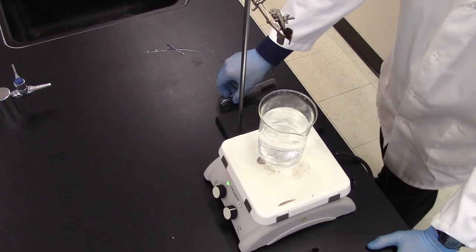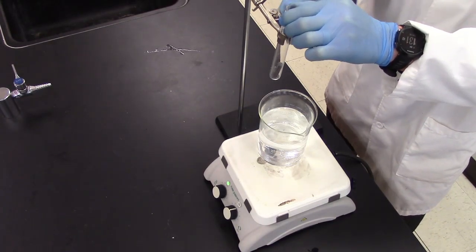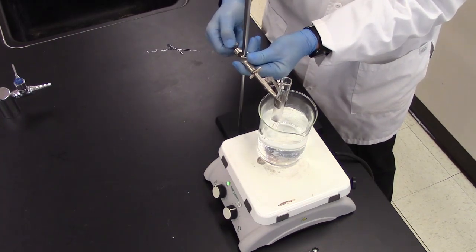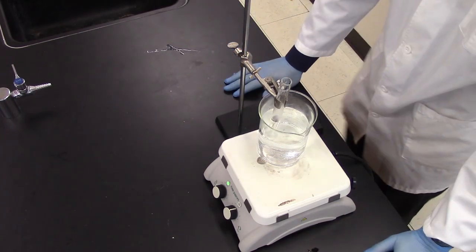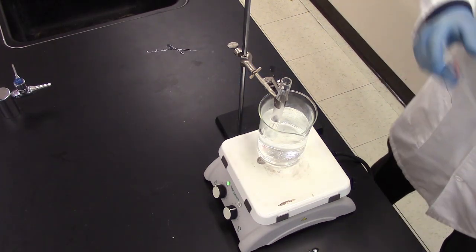My next step is to attach my test tube with the metal to the clamp here and then I'm going to lower my clamp so my test tube is, so the metal rather, is just below the water line. And I'm going to take a thermometer and stick it into the test tube.